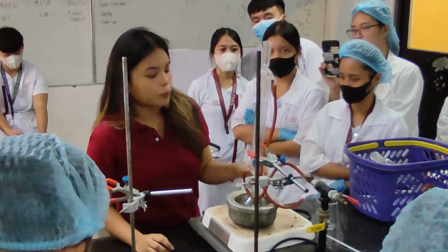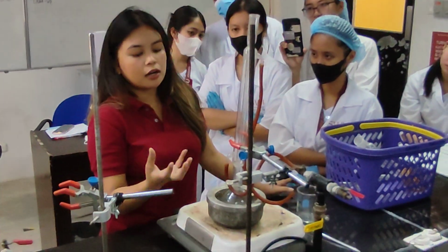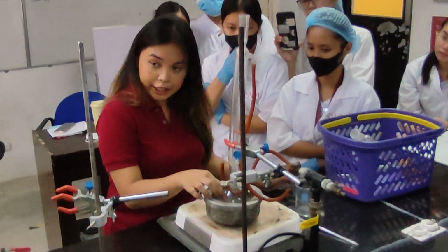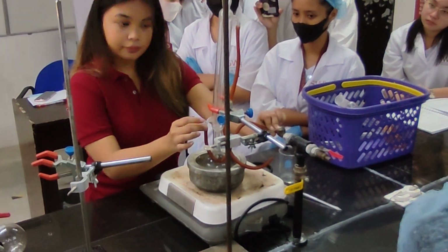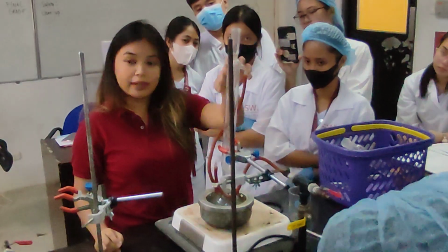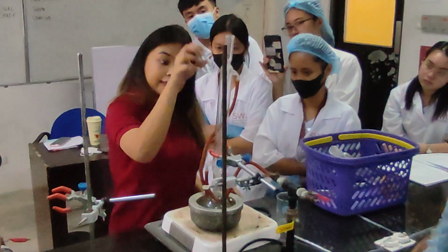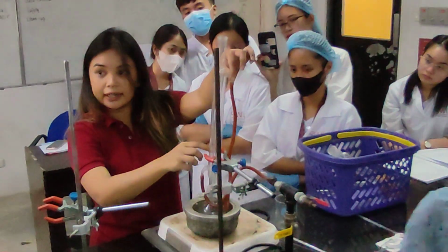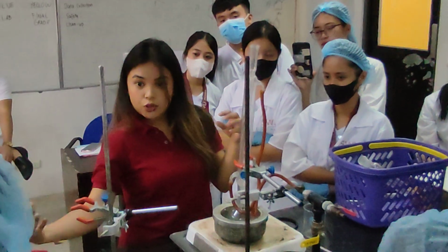Okay, so you will place your solute and your solvent here, or any components that you want to observe in heating. So the mixture goes here, and then water in at the bottom, water out at the top, because you want the water to fill the condenser completely. Same with the distillation setup, right? Water in at the bottom.